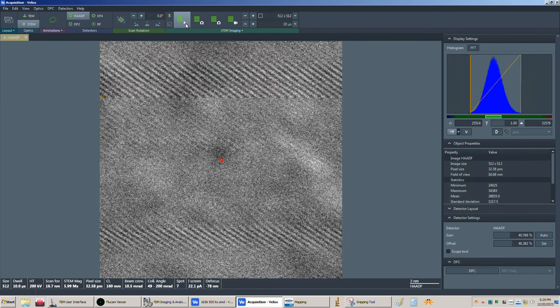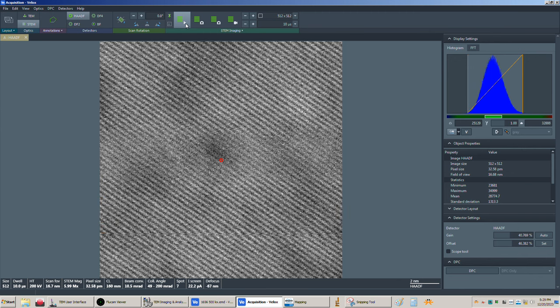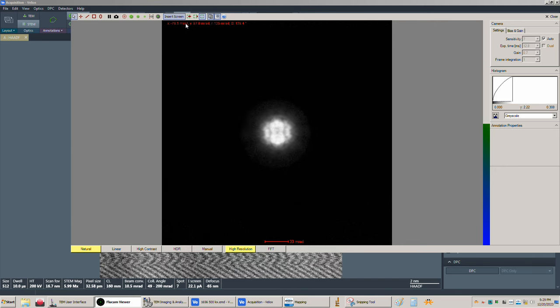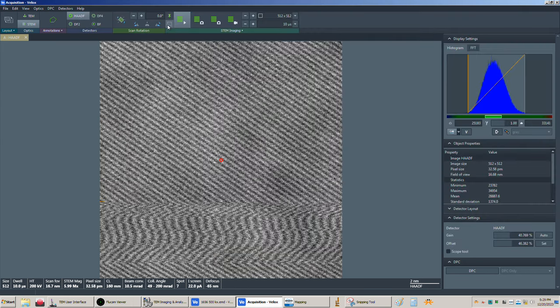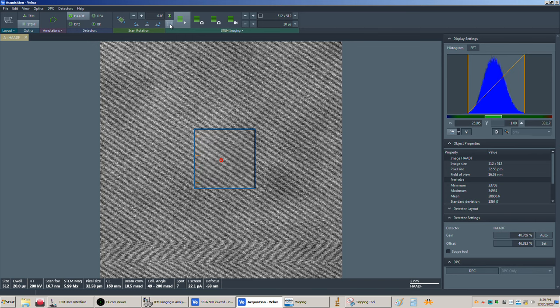Because it looks to me like there's no reason why that shouldn't be stigmating a little bit better than that. I mean, the zone axis alignment is good. This looks pretty good here. And we can try one more time here, because I'm at a loss as to why it's not. Again, unless there's some kind of field effect going on in here, or there's something wrong with the, well, shouldn't happen, right? The room meets all the specs. So that's why I'm baffled here. Why I can't shoot spec on this thing.